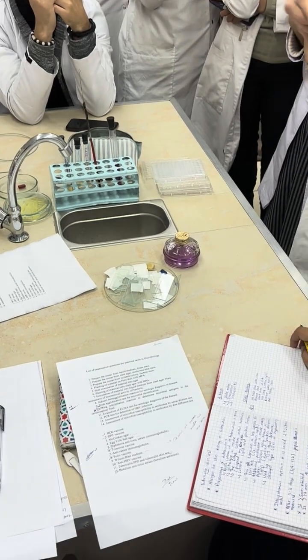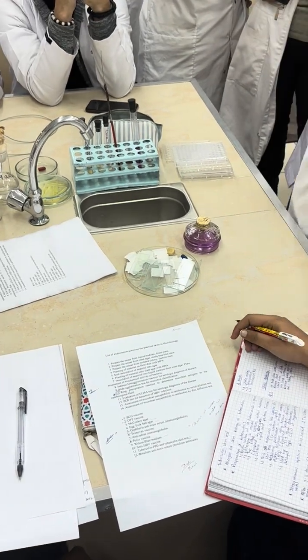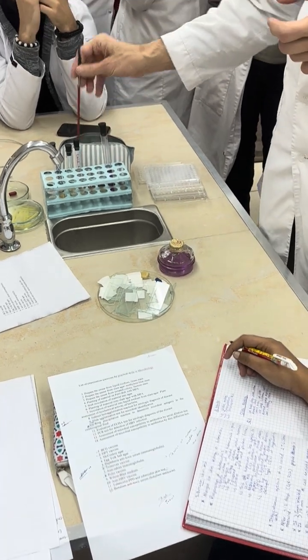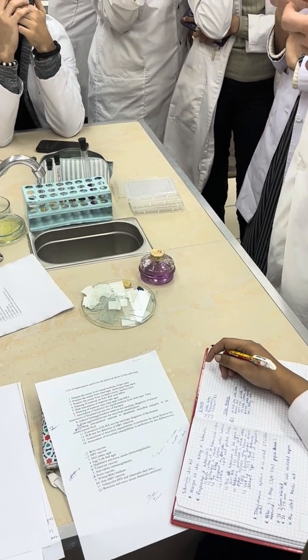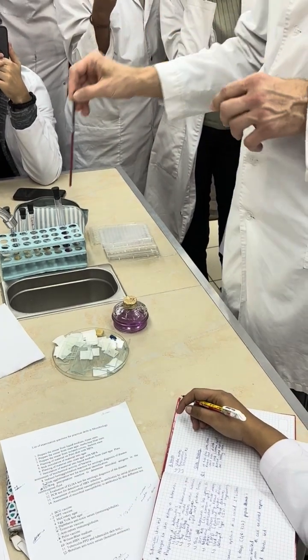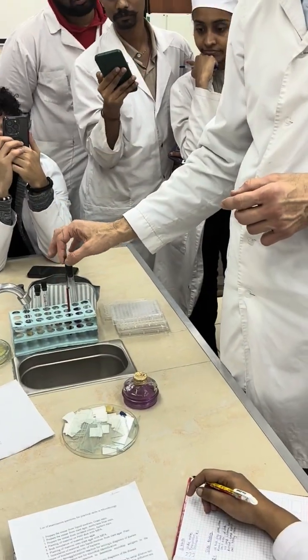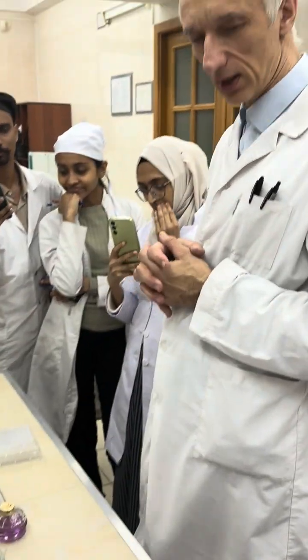For yourself. All wastes, of course, should be in waste trays. Moreover, if you're doing something with some instrument, it should be in your hands or in a stand, not upon the table, not in the pocket, not somewhere else. Okay, let it be so.